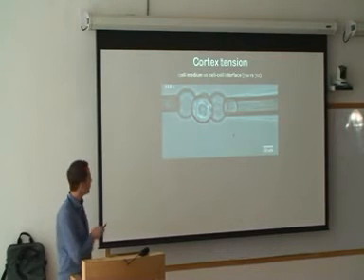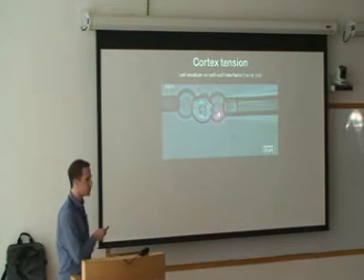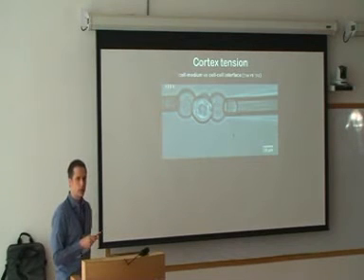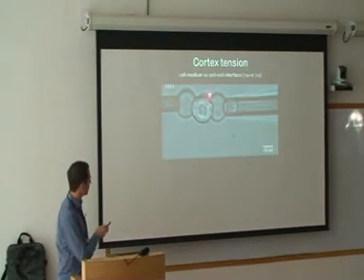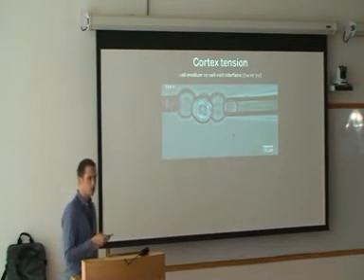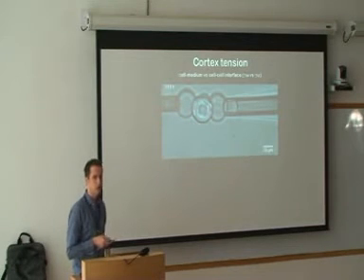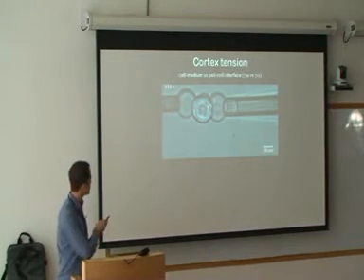And then what we are doing is we are pulling this triplet apart. And what we want to have is that it breaks either here or here, it doesn't matter. But what you do is you basically dissociate two cells from each other. And the reason why we're using triplets is that the cell in the middle is unperturbed by the pipettes, because if you're aspirating these cells, you can see that you get this tongue inside the pipette which deforms the cells, and by deforming the cells, you might change properties like cortical adhesion and adhesion tension of these cells.